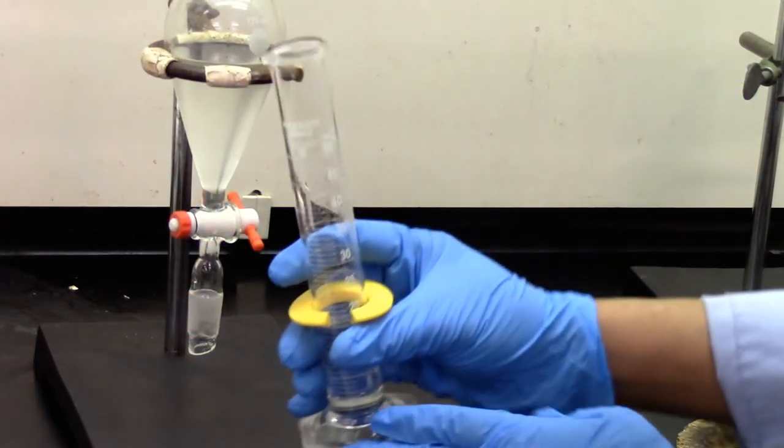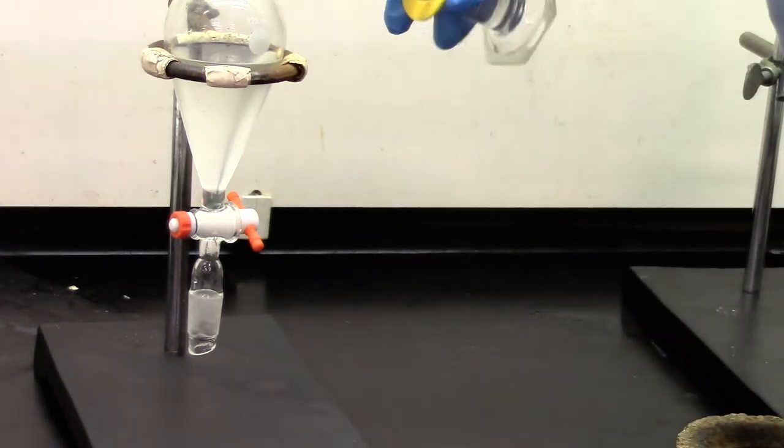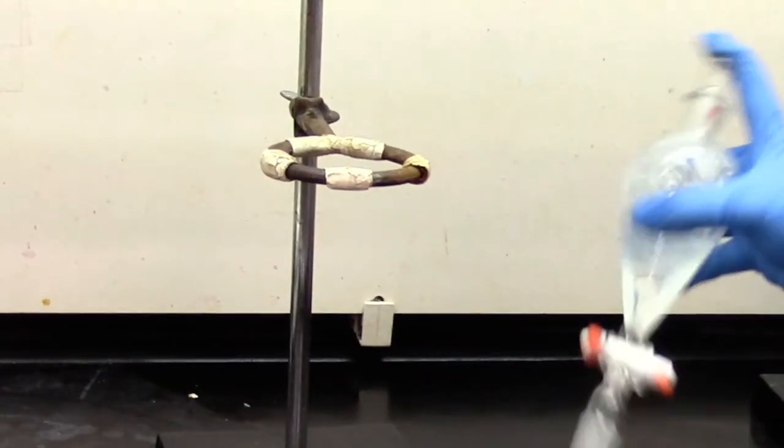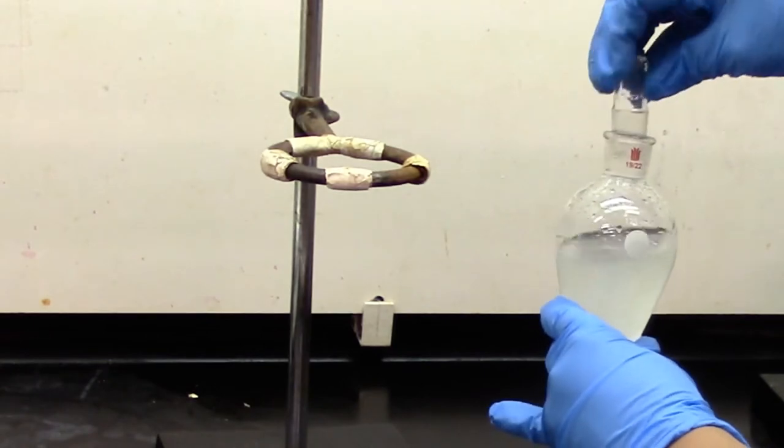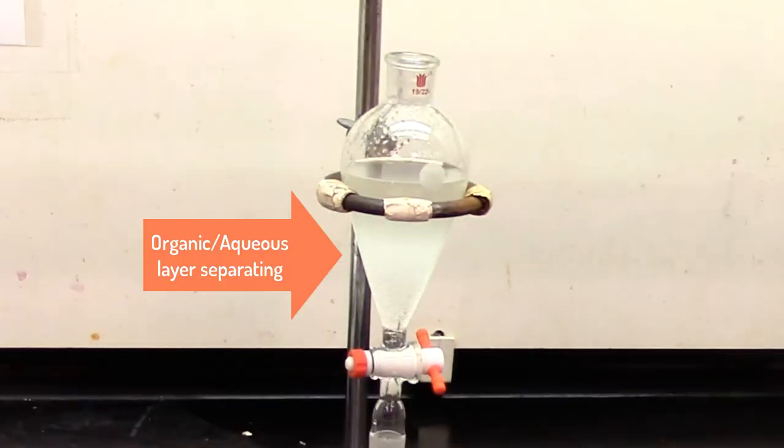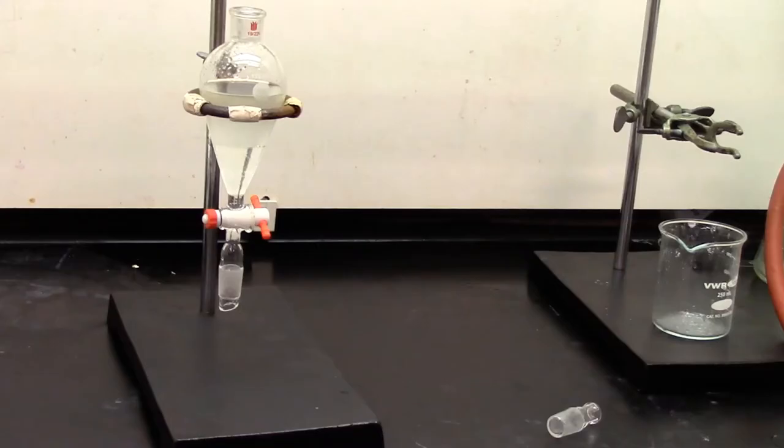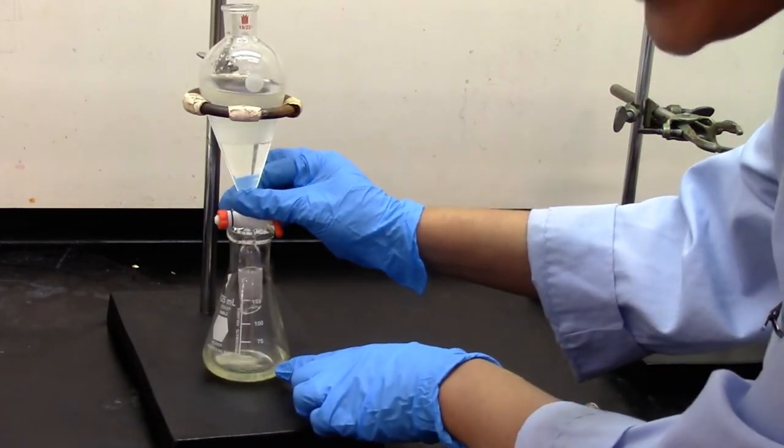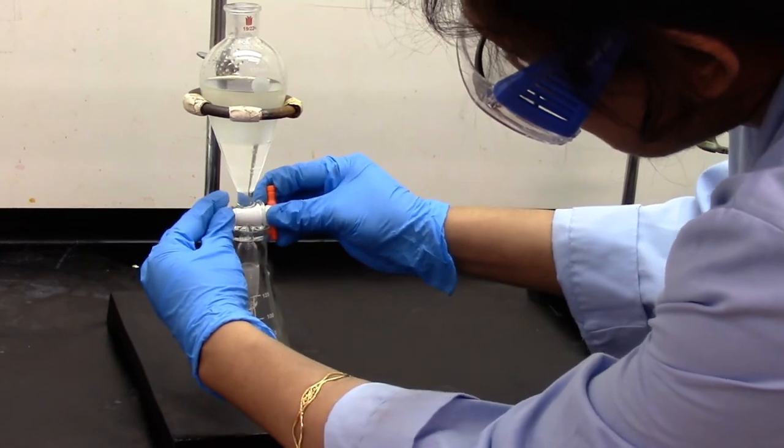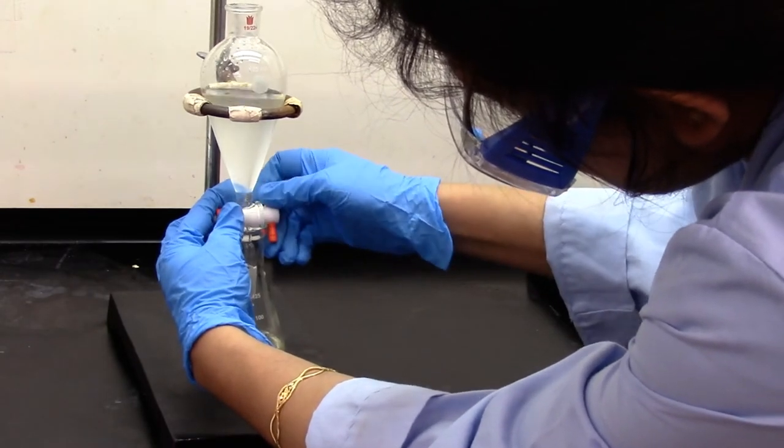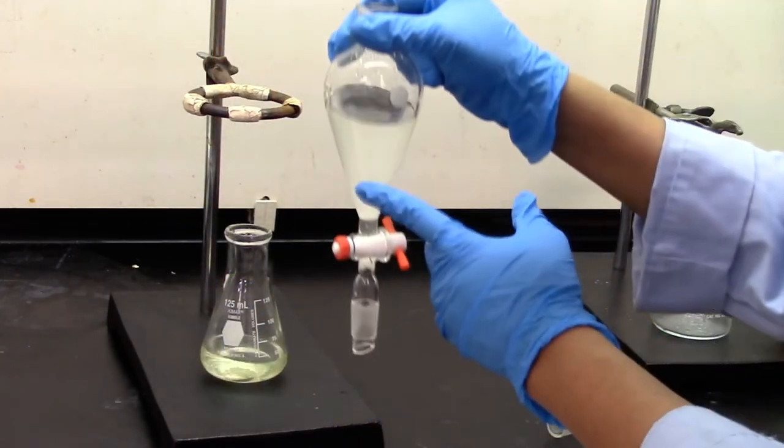To the top layer, we're going to add 15 mL of dichloromethane. Mix, and then uncap and let it separate into two layers. Again, we see two layers. I'm going to transfer the bottom layer into the same Erlenmeyer flask where I had my first extract. The top layer is a discard.